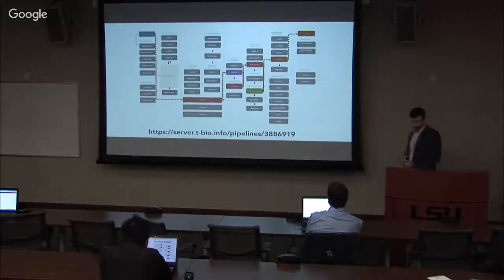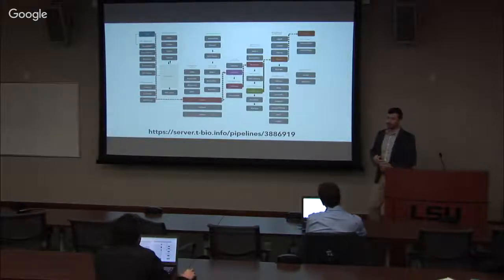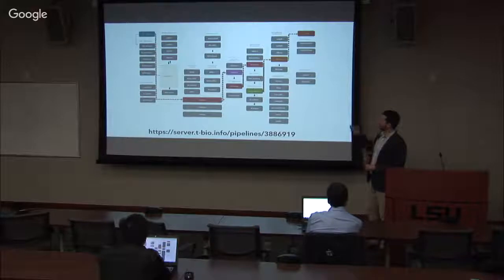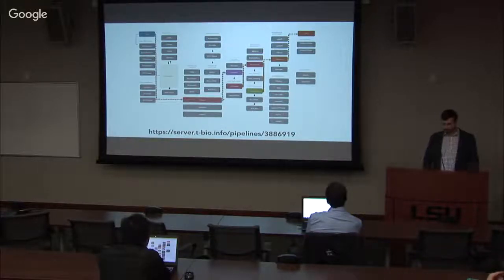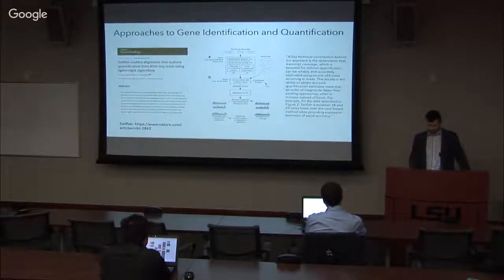And this is what it looked like last time when we did it. And so you can see TopHat, which today has been replaced by HISAT2. And then you have Cufflinks, Cuffmerge. And then you take that information and you align all of your reads on identified transcripts. And then you have to prepare an expression table. And that is the step of quantification.